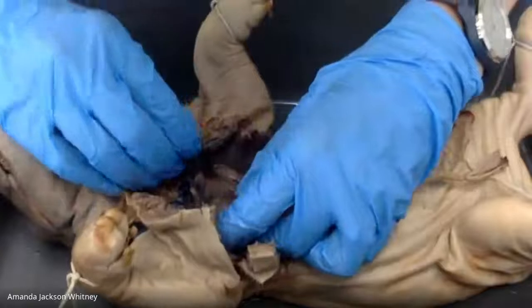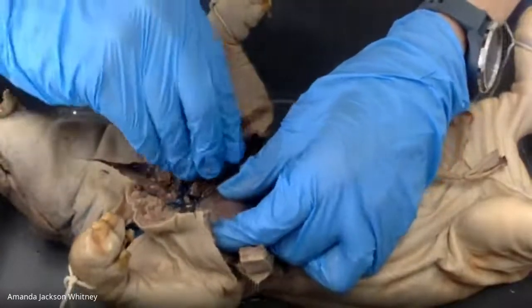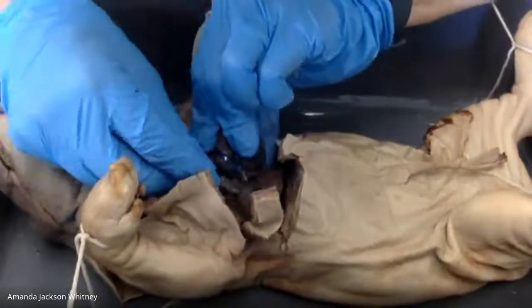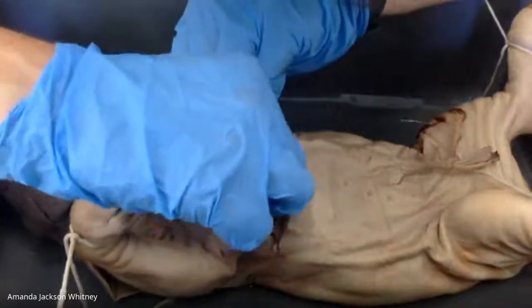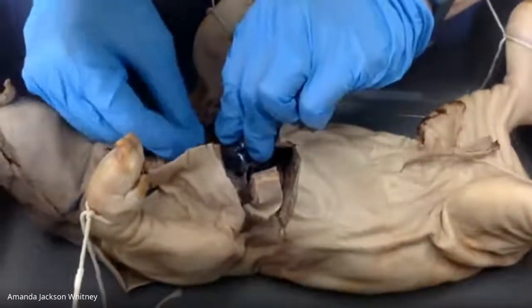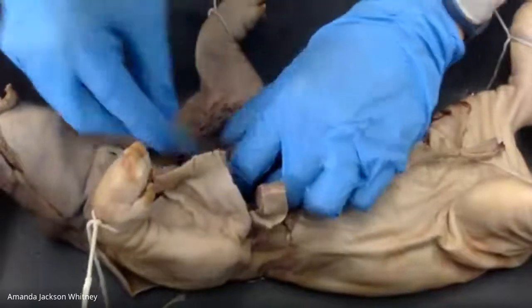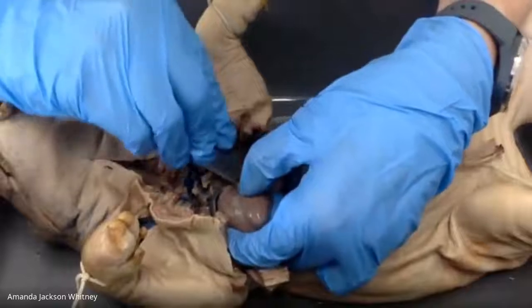So I've got to cut away at the connections that are between the heart and the lungs. Does anyone remember what those are? Some of us tried to forget all of this as soon as we could. But wait, can you repeat your question? Yeah, what's connecting the lungs and the heart? So I'm having to cut it out here, right? So what am I having to cut through to disconnect the heart from the lungs?